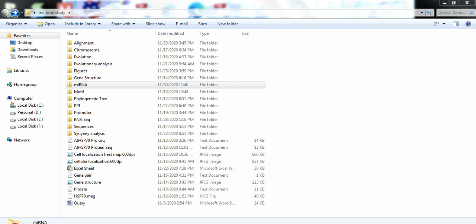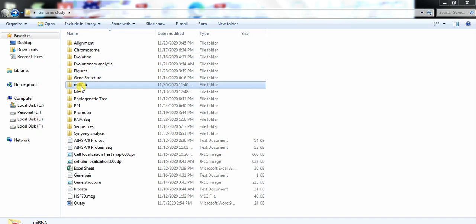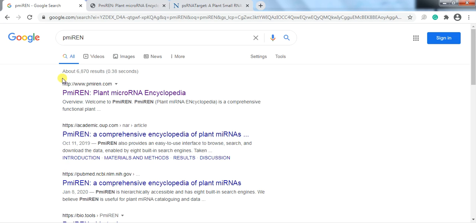First, you need to open the folder where you are keeping your files. Make a subfolder and name it 'microRNA'. Then open Google.